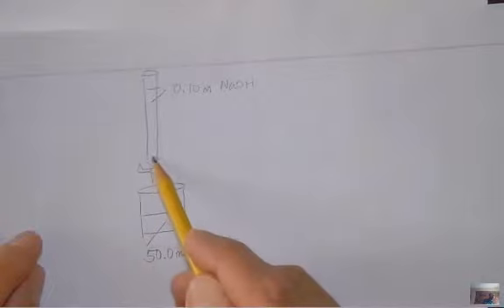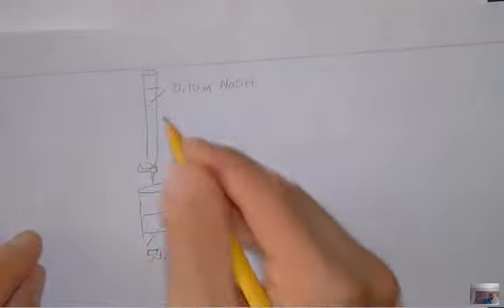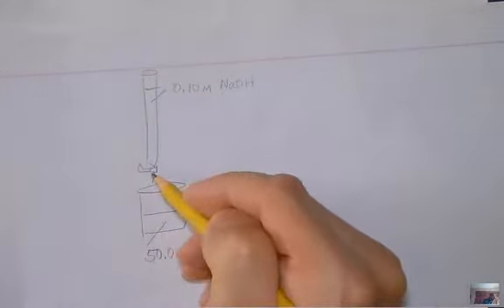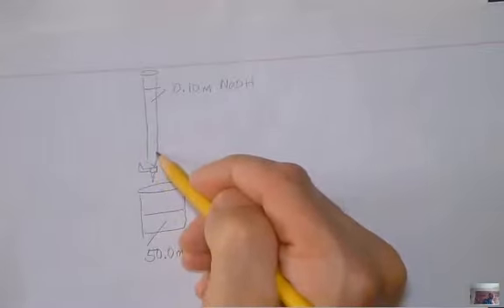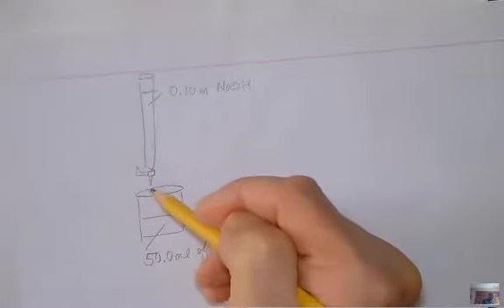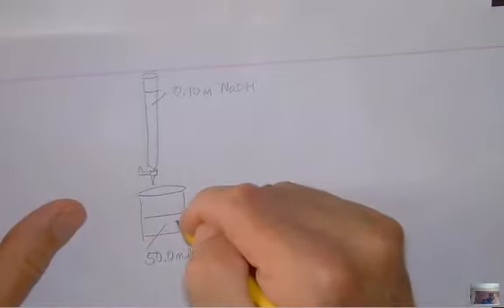Then I'm going to slowly put it in, and I'm going to calculate the pH at a bunch of different points. Okay? So when you put this in, you get rid of any air drops that are in the burette. You shake it and get rid of them. Make sure that everything works correctly, and that the stopcock doesn't leak, and you're ready to go. Oh, you need one more thing in here.